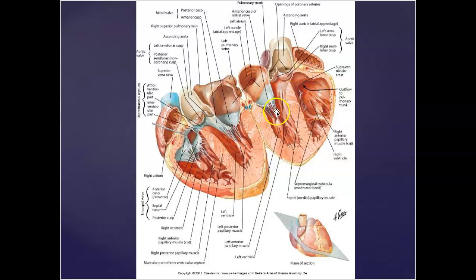Oop, I got that wrong, didn't I? Oxygenated blood on the left side, because this is left and left. Well, let's go to this side. Oxygenated blood will mix with deoxygenated blood, and that can be tough with newborns.